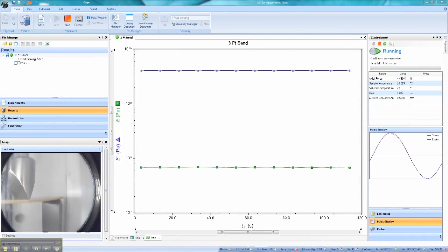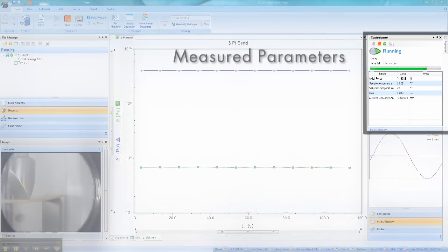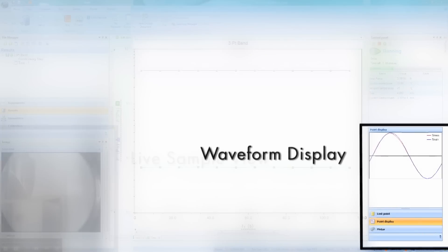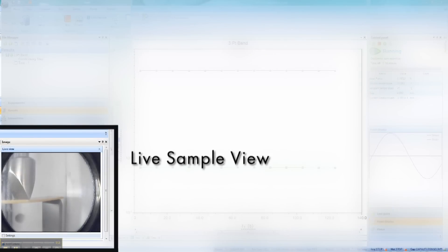While running a test, real-time information is always at your fingertips, including measured parameters, waveform display, and live sample view from the oven camera.